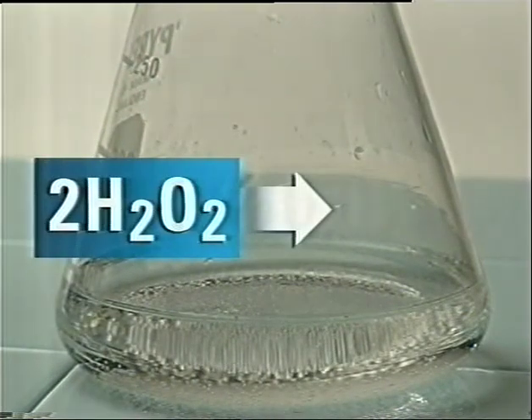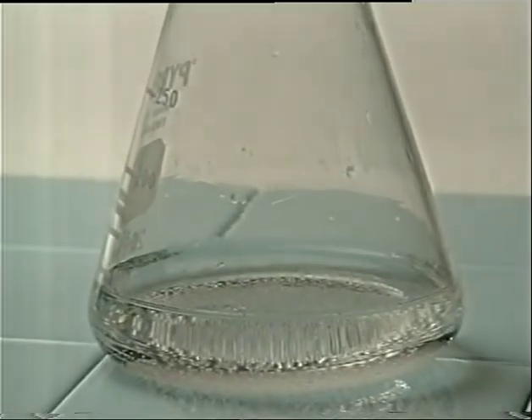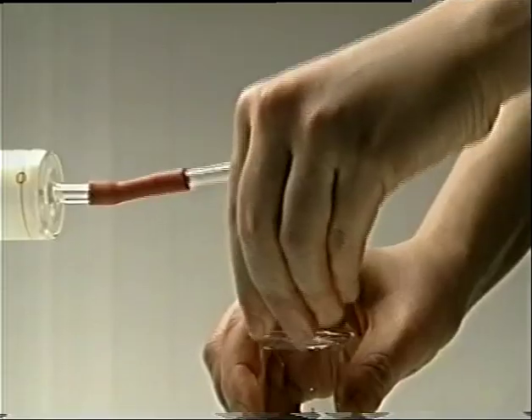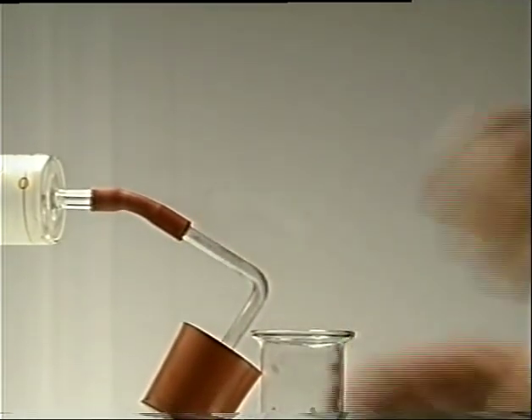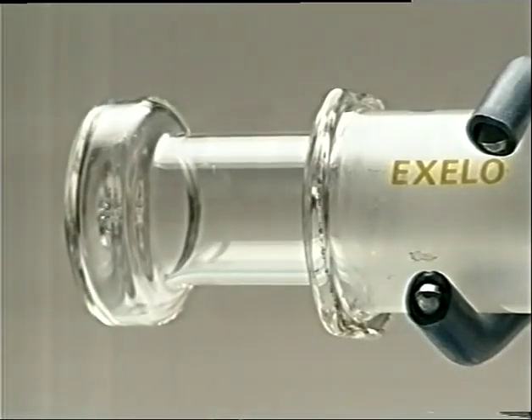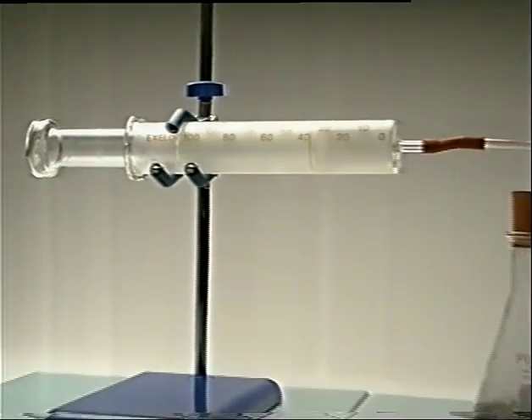This is hydrogen peroxide. It slowly decomposes to form water and oxygen. Any oxygen produced will be collected in the syringe. But at room temperature, the reaction is so slow you'd think nothing was happening. One way of speeding up a reaction is to add a catalyst. Add manganese dioxide and the hydrogen peroxide quickly decomposes, producing oxygen. But is it the best catalyst for the job?